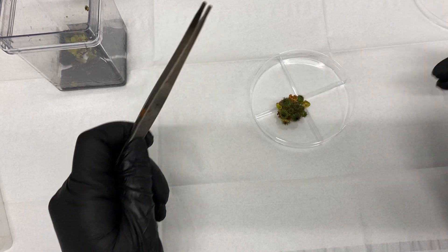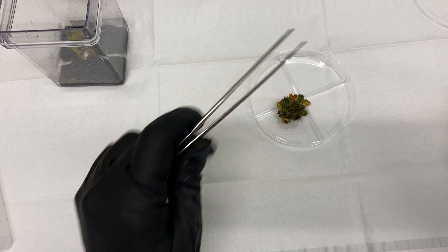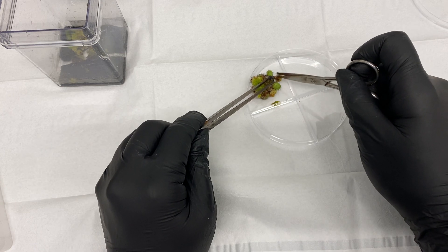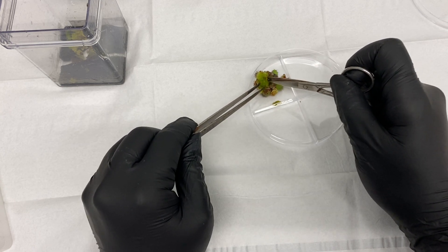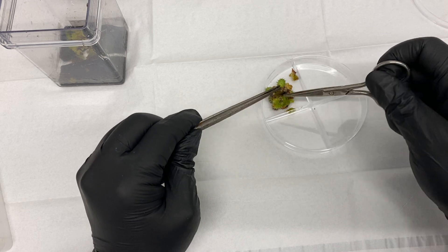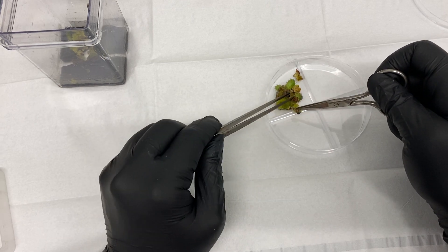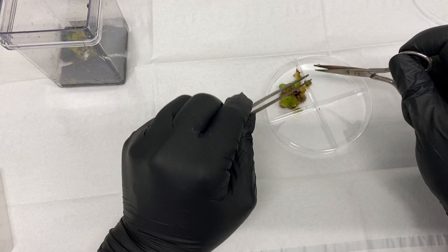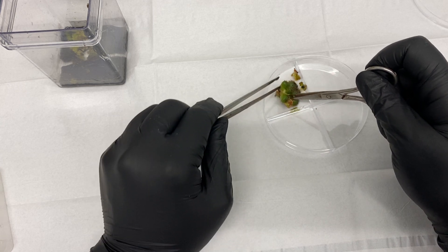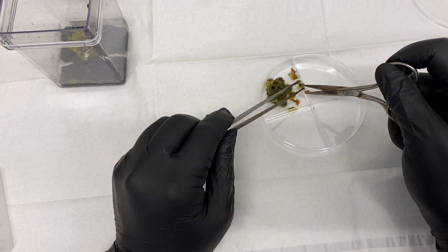I'm pressing on it very lightly to see if it'll fall apart naturally or if I'm going to have to break it apart. Right now this callus coming off is called friable callus — you'll see that term in a lot of papers. Friable callus means the callus just falls right off.